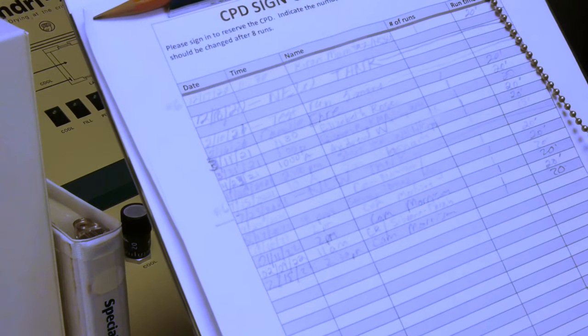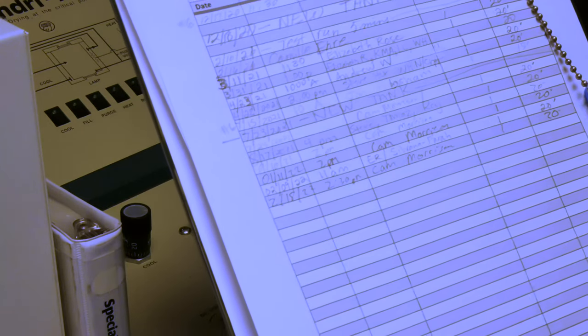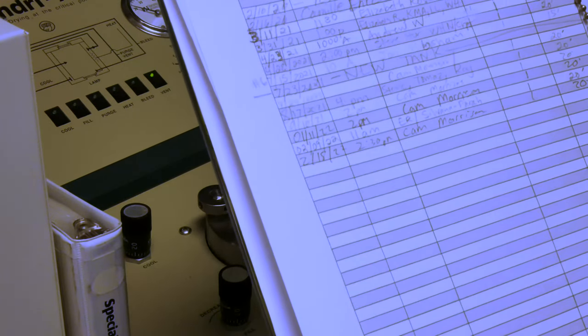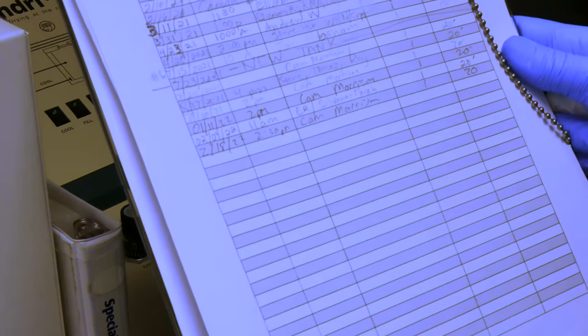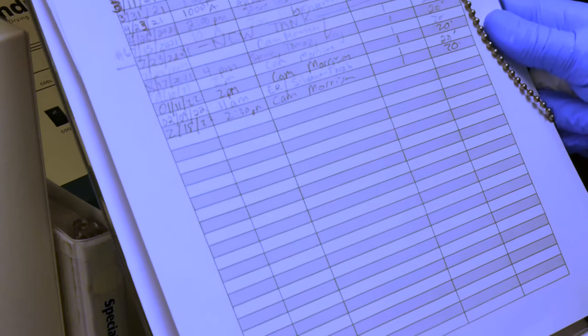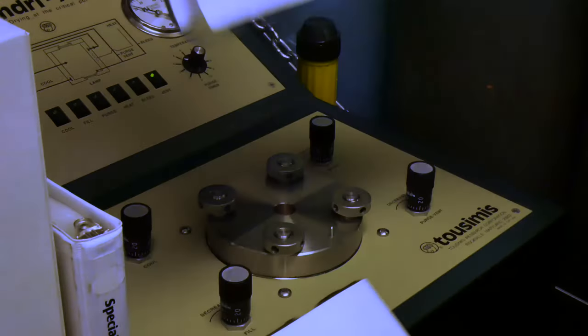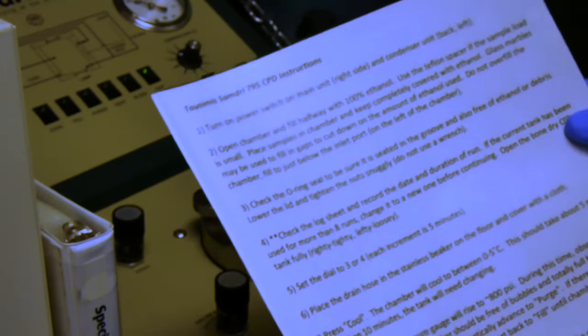And we are today on seven. Often we get seven, eight runs from a tank. It may be that today we will have to make a tank change in the middle of the run. Hopefully we can avoid that. But if so, we'll have it recorded. We will document on the log sheet once we have the run underway.